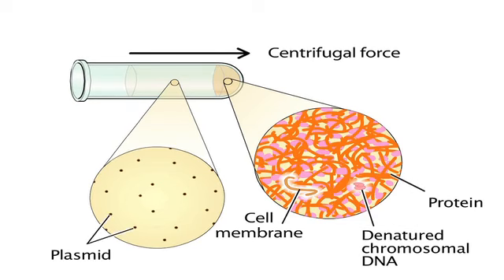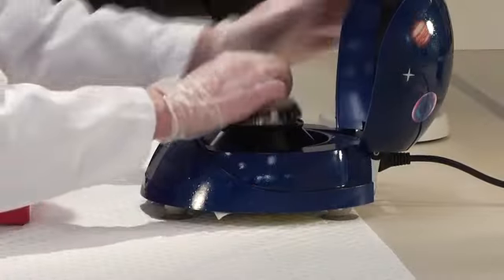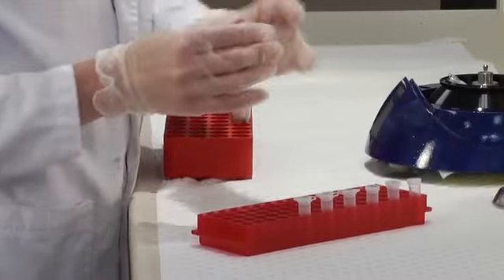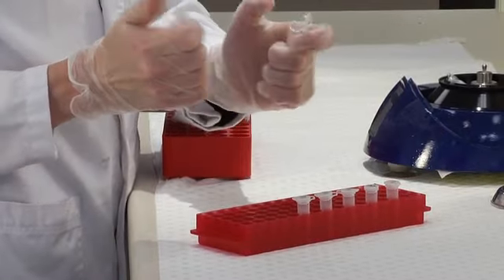And so, the plasmid remains in the supernatant. So now, the soluble plasmid remains in solution. And we'll transfer that into a new tube.